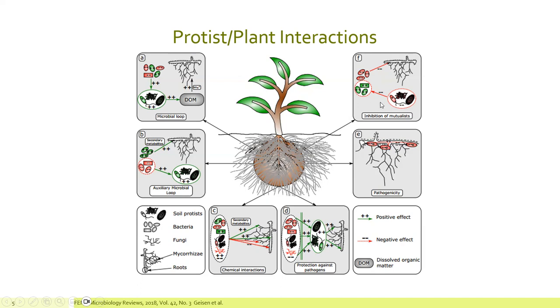And similarly, you can see on F here, where your protists are consuming some of these beneficial microbes as well, particularly bacteria. We'll get into why these are beneficial to the plant. So let's go to the next slide.